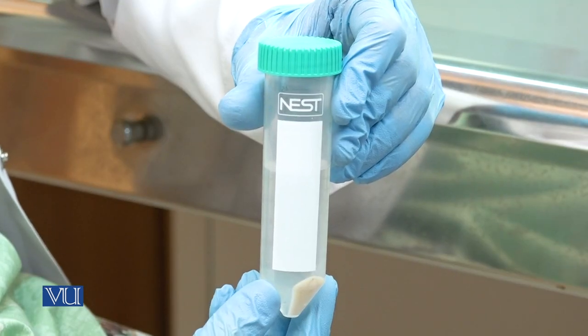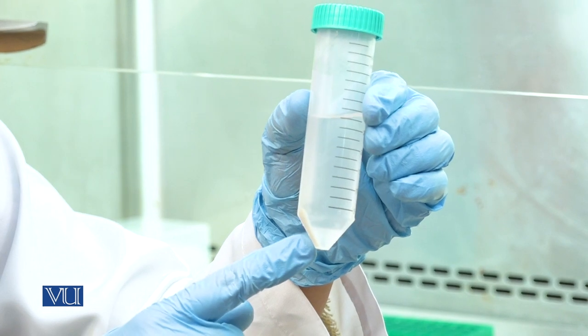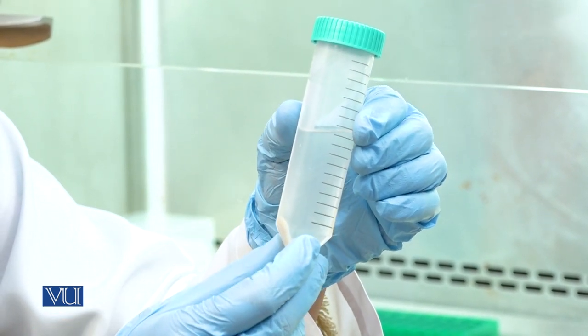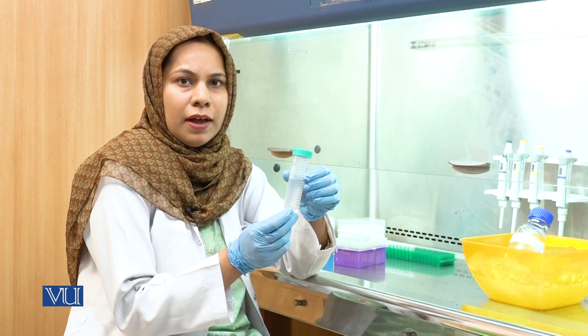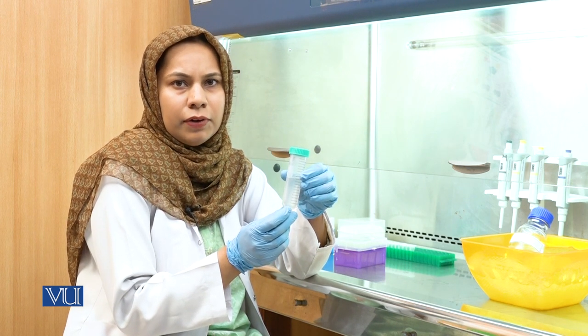After centrifugation of the calcium chloride containing culture at 4 degrees centigrade, 3000 g, we will again obtain supernatant and pellet. Now we need to discard the supernatant and we will dissolve this pellet in calcium chloride solution, 2 ml. After complete dissolution, we will aliquot the suspension and our competent cells will be ready.